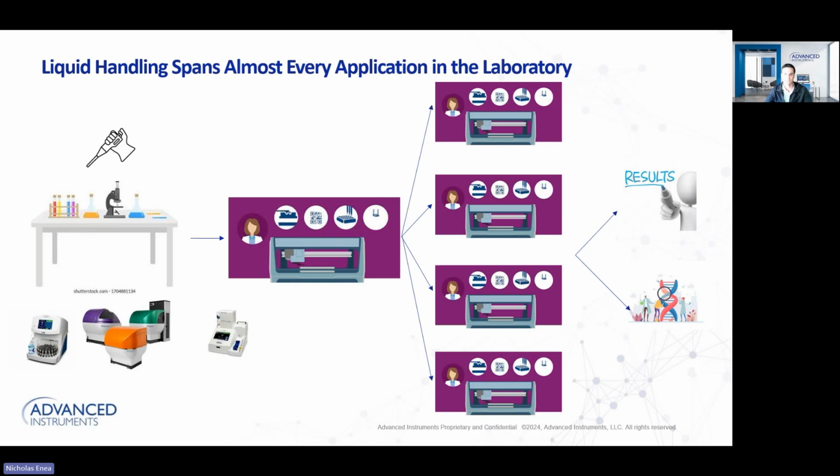At times you'll hear me say pipettes, sometimes you'll hear me say liquid handlers, but in general, everything that I talk about today is going to apply to both realms of the liquid handling world. So I just want to establish that as a base for everyone here.